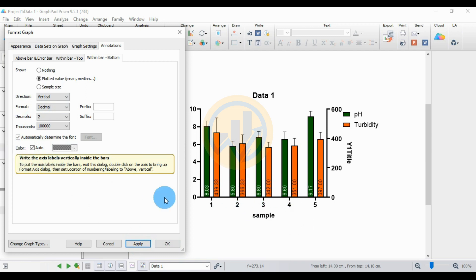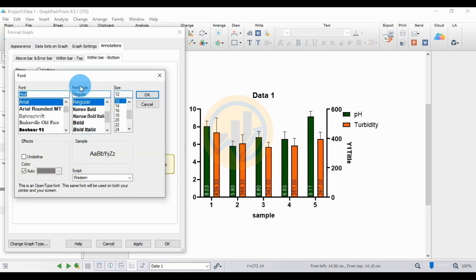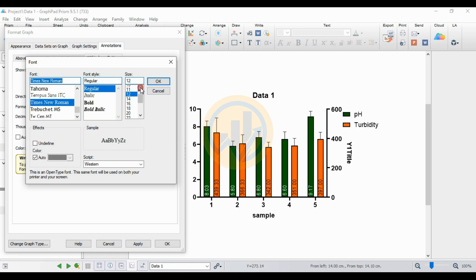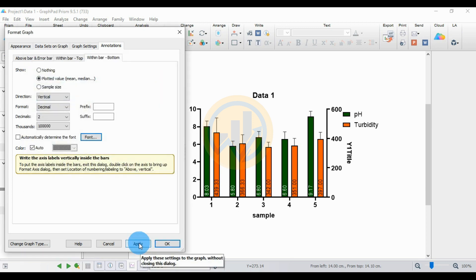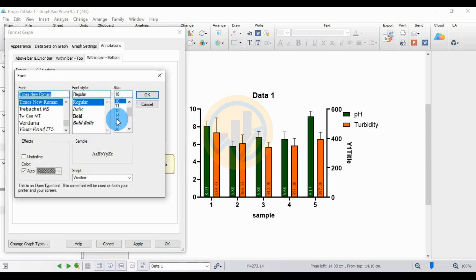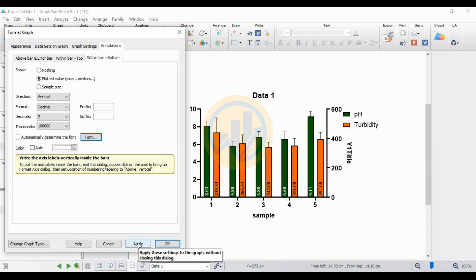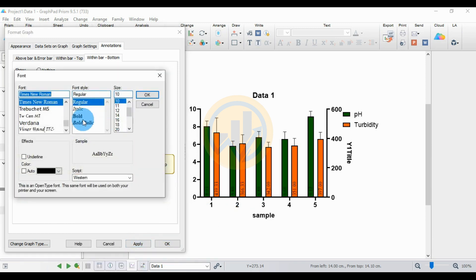Now customize the data value font. Unclick the automatic font option, then open the font menu. Click the button to open the new font options tab. Many fonts are available in the system. I choose Times New Roman, Regular, size 12, and change it to size 10. Click Apply. Then change to Bold — click the Bold option. Then change the font color: use the auto option, select white color, then apply white, or choose black. Change color to black, and set Bold.